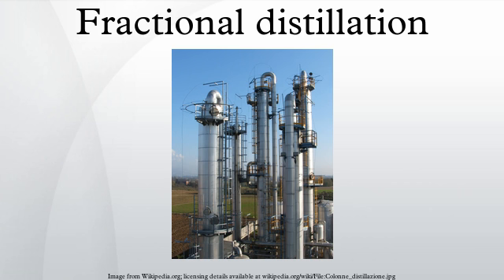The condensate will be close to the azeotropic composition, but when much of the ethanol has been drawn off, the condensate becomes gradually richer in water. The process continues until all the ethanol boils out of the mixture. This point can be recognized by the sharp rise in temperature shown on the thermometer. The above explanation reflects the theoretical way fractionation works.